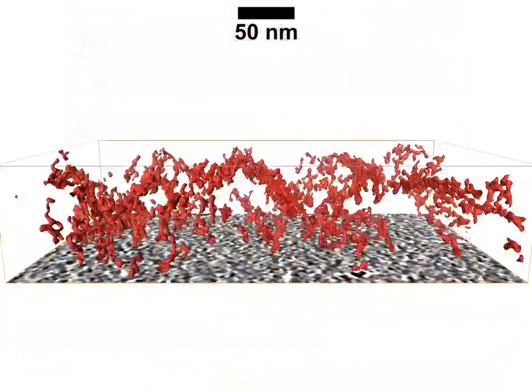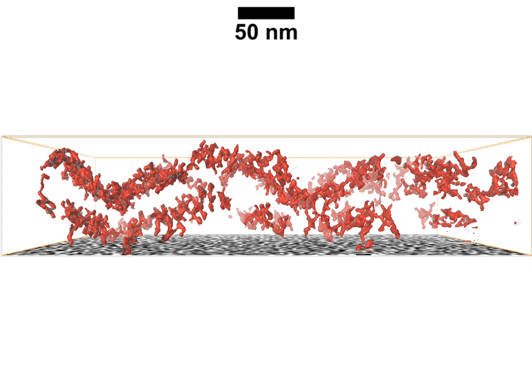The isosurface is rotated to present a view perpendicular to the sacculus long axis. Note that after collapsing, the sacculus appears corrugated.